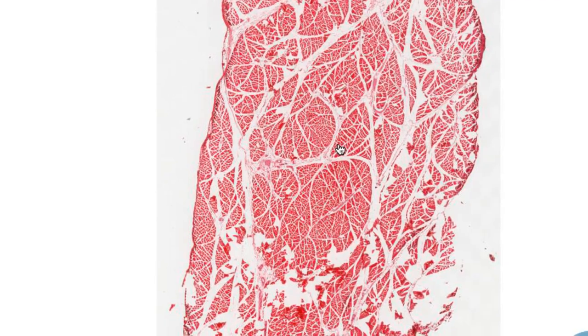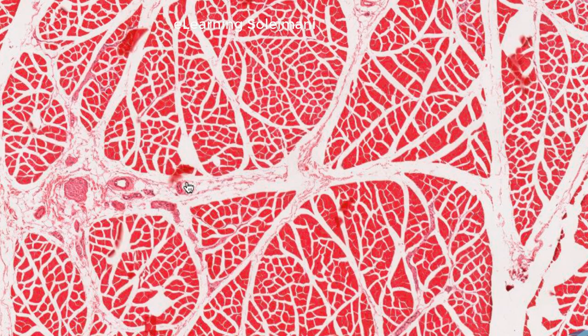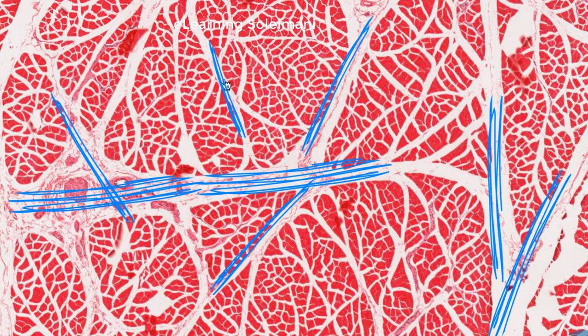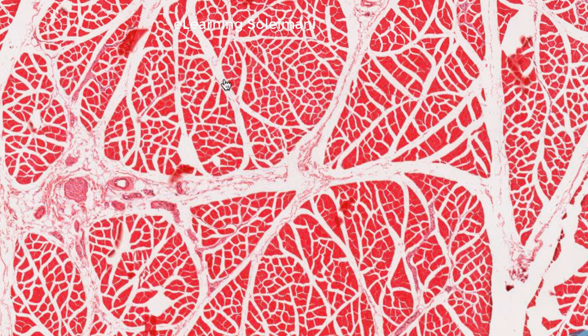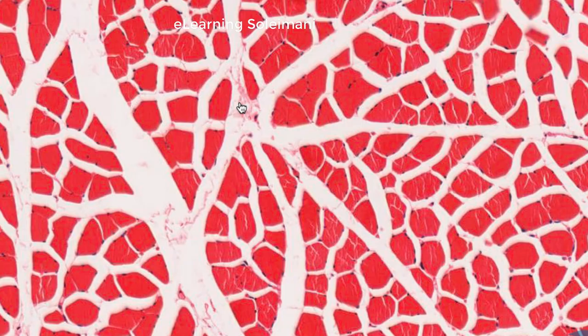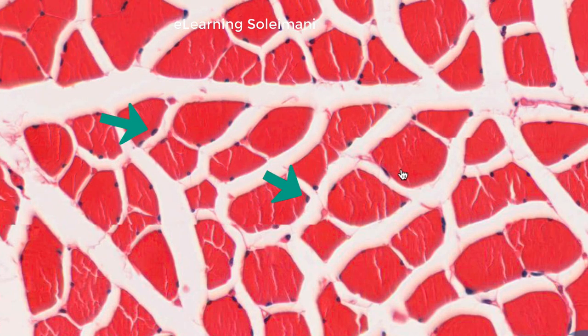This slide shows a transverse section of a striated muscle tissue. You can observe the presence of epimysium, muscle fascicles, and perimysium around them. The nuclei of the muscle cells are visible just beneath the sarcolemma.